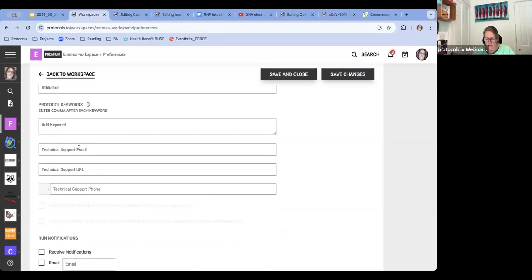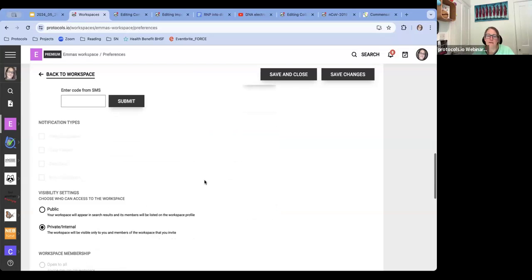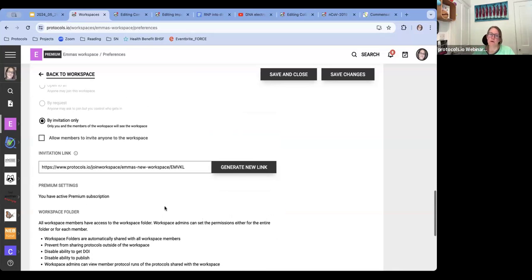Tech support: we often have users who are at core facilities and things like this, so that becomes more relevant. You can configure if you want notifications for different things. You can configure if it's private or public. So mine is private. They always start out private when you make a new workspace. If for your lab you want a public facing one where published protocols will be visible, you can create a public one. So I know I've got users in Manchester and Rothamsted, both of whom have a license, so you would be able to have unlimited. If you don't have a license, you may not have as many workspaces, but you would still be able to configure this for any workspace you do create.